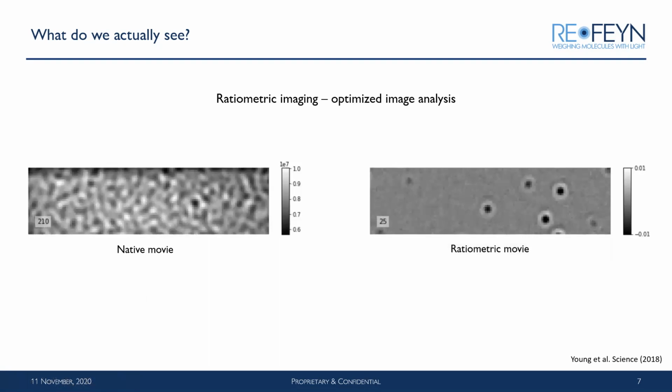The reason that they disappear is because this background that we calculate is a moving background. So once they bind to the surface, we see their signal, and then they become part of the background, and that's why they disappear. And it's not that they diffuse or leave the surface; they stay bound to the glass.